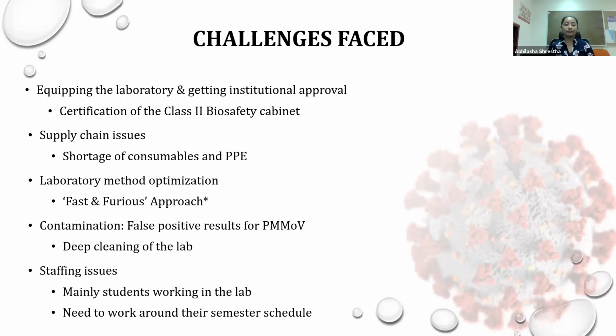The next challenge that we have faced, and are continually facing, is this PMMOV contamination issue in our method blank. We have worked through different cleaning methods, we have tried different extraction approaches, and we still end up with this contamination. So if we decide to use PMMOV for correcting for fecal strength in our data, we need to figure out how this contamination is going to affect our normalization.